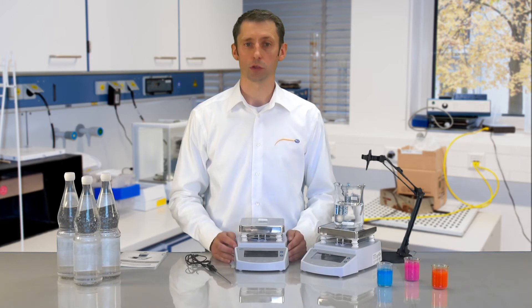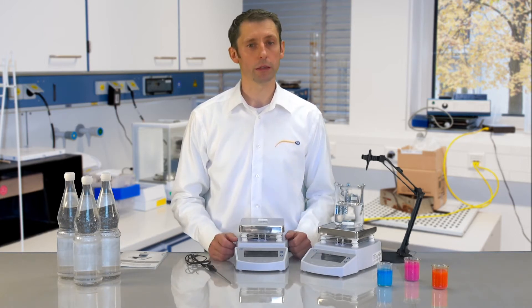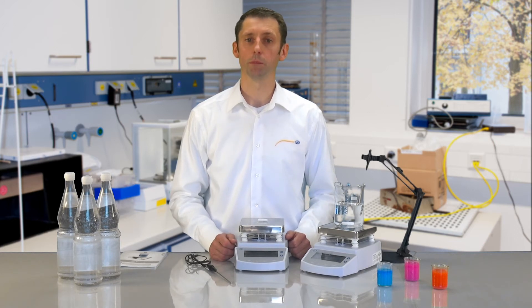Further technical data as well as optional accessories you can find on our internet site at www.pcinstruments.com.